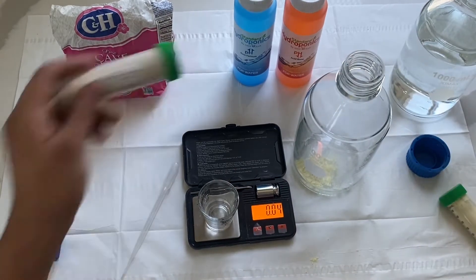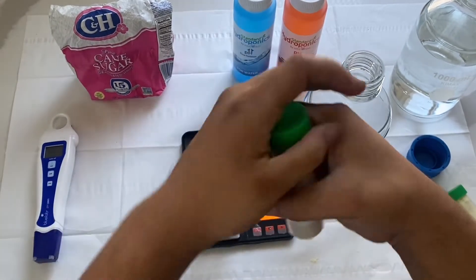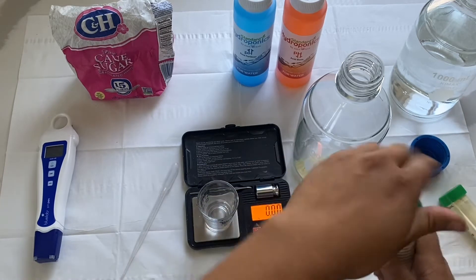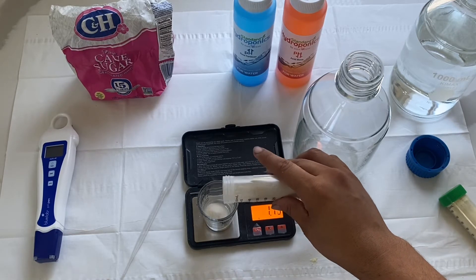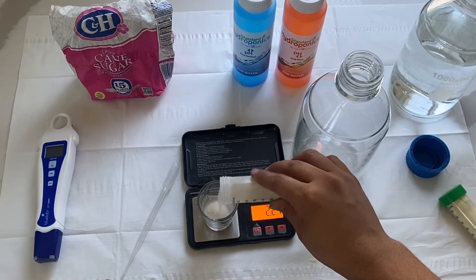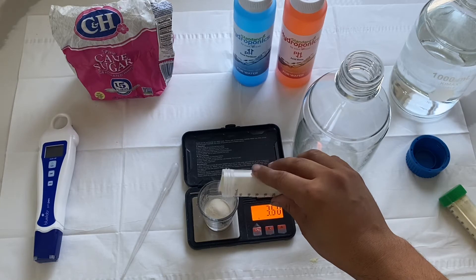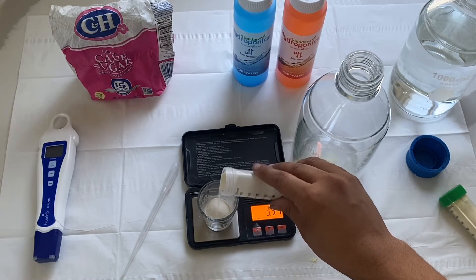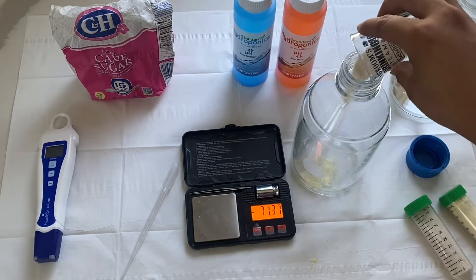Now we're going to do our agar. This is the most important ingredient in my opinion as far as morphology and how they're going to grow. I like to use eight grams per liter, and we're doing half, so we're going to do four grams. It's also very dependent on your gel strength — if it's stronger, you can use less; if it's less, you can use more. For the eight grams per liter ratio, that gives you a nice solid gel that you can play with from there.